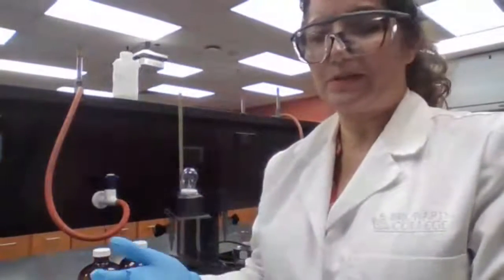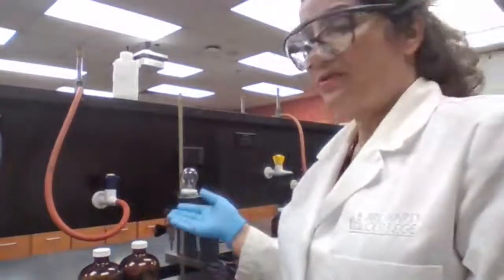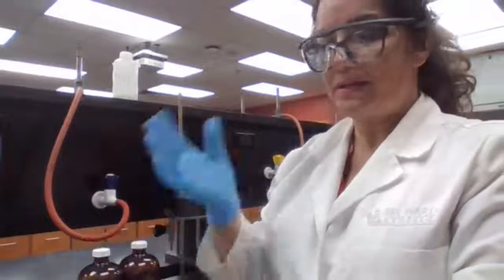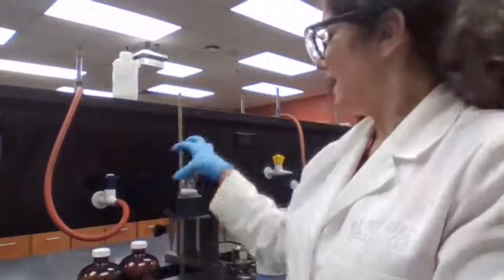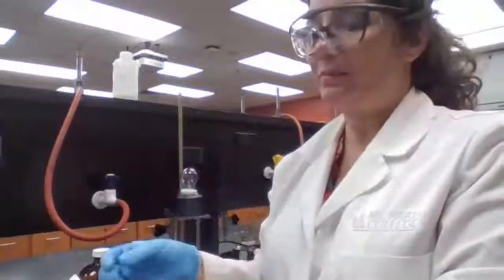That's the difference. A strong acid dissociates 100%, so it generates lots of ions. If you have lots of ions, you can transfer electrons much faster. But if you have fewer ions, then the transfer of electrons is going to be slower, and the light bulb is going to be dim. It generates very dim light.